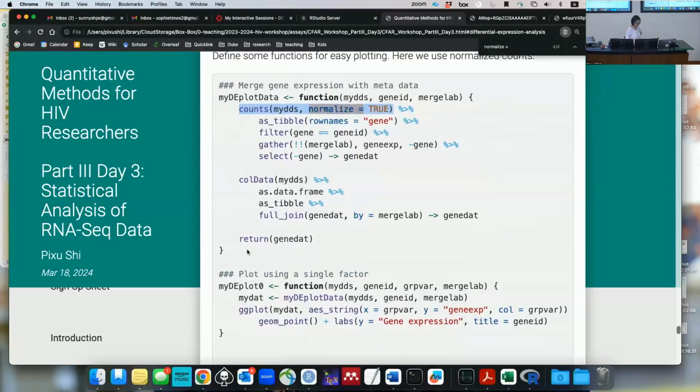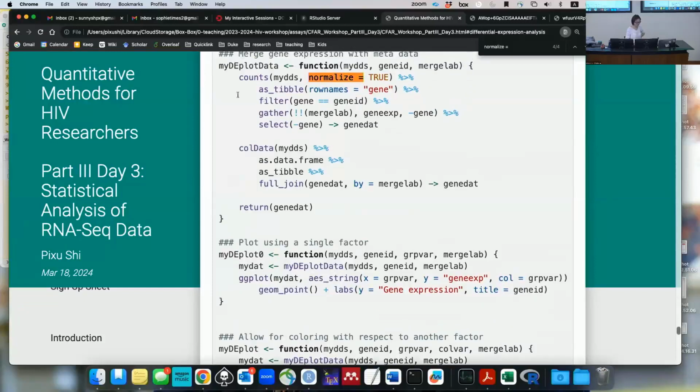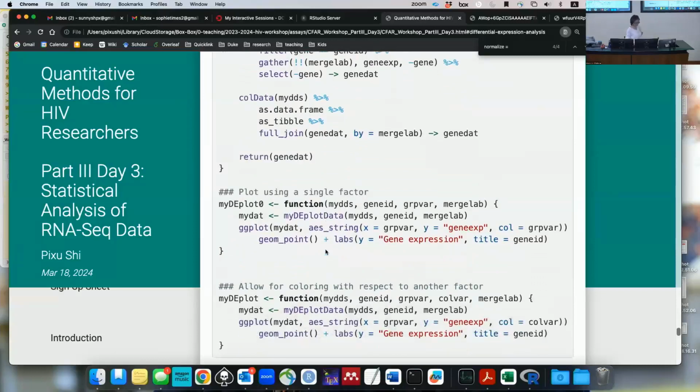And this count can be used to visualize the individual genes. And the functions here I'm providing, these are just giving you a simple way of plotting the dot plot. But essentially, you can write your own code. You can just get this count matrix, take out that column, and just plot that column against your variables of interest. That's not too complicated. This is making it look complicated. I inherited these functions from a previous lecture.